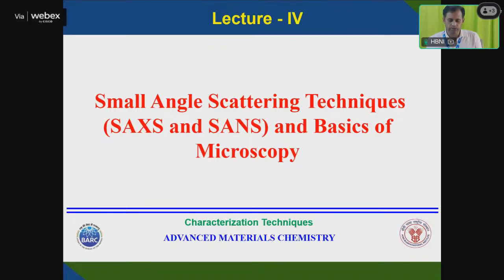But today we'll study the scattering technique, which is mostly useful to measure particle size, particle shape, and porosity. All this information you get from the small angle X-ray scattering technique. Afterward, if time permits, we will discuss the remaining part, the neutron diffraction technique that I could not cover in the last class.